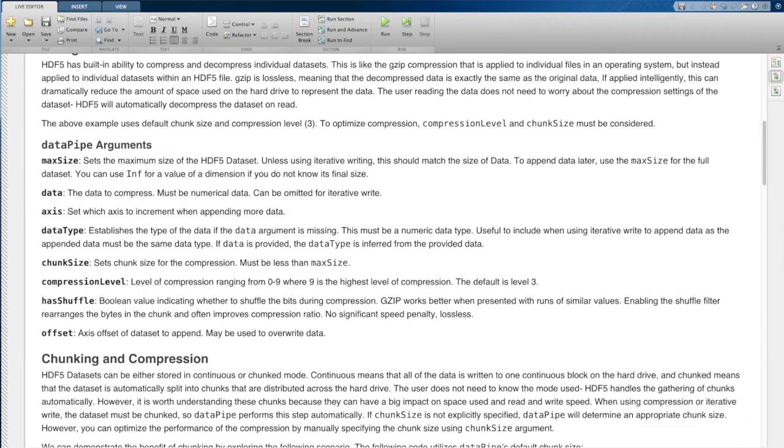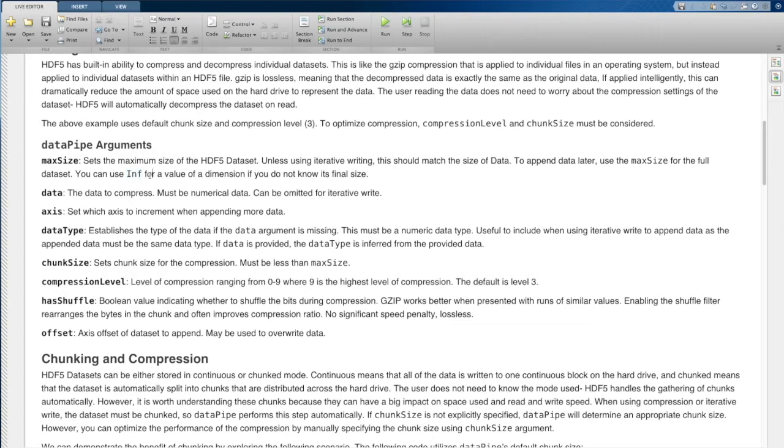And if you want to iteratively write this data set, you're going to need to increase the maximum size beyond the original size of the data set. You can use the inf value to make the data set unbounded in particular dimensions.